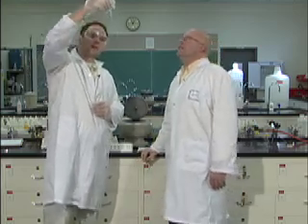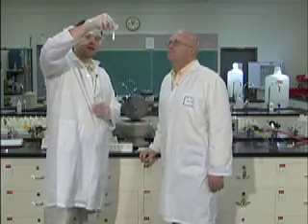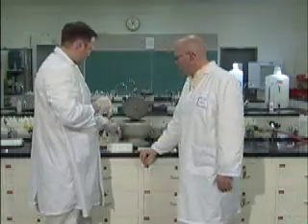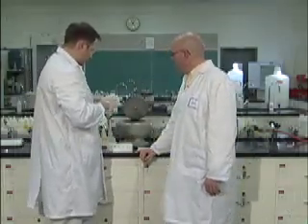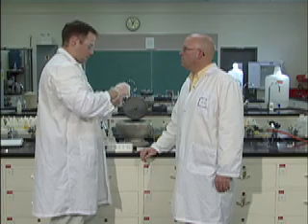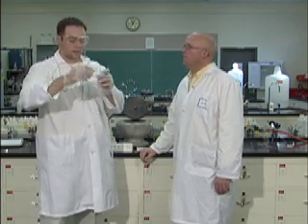Okay, we're going to mix it up, and what happens to our solid? Well, it goes back into solution. It dissolves into solution. Now I can't see a precipitate there anymore. Nope, none at all. And now to that, we're going to add nitric acid. Since we added hydrochloric acid in the first step and got a solid, if we add nitric acid in this step, we would expect to get a solid back if we have silver.